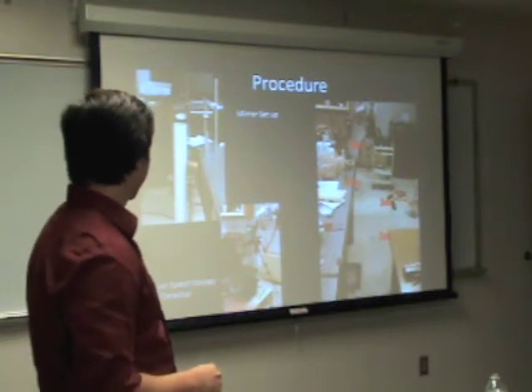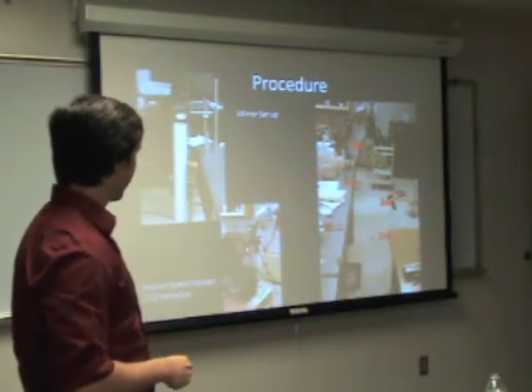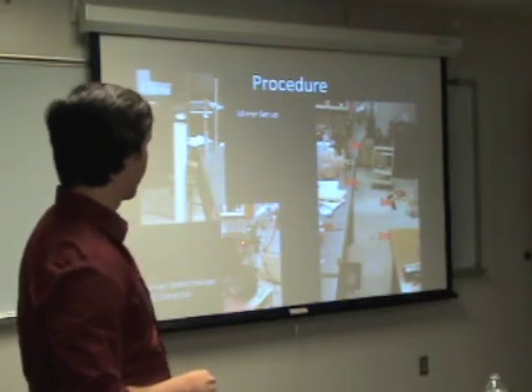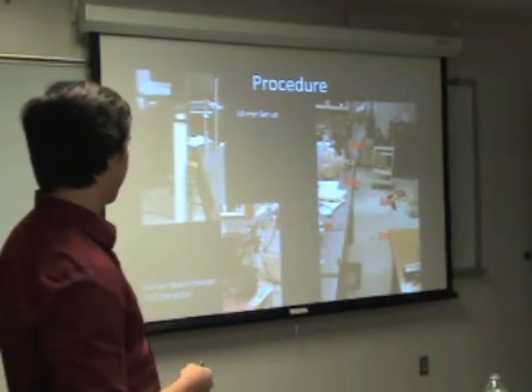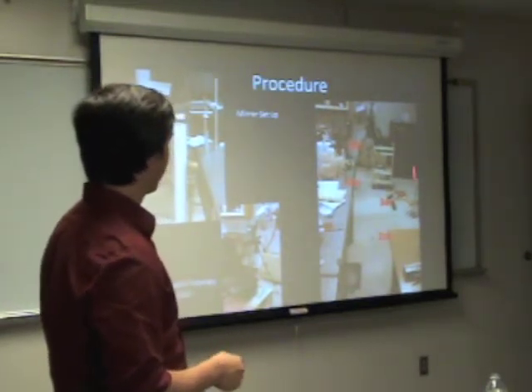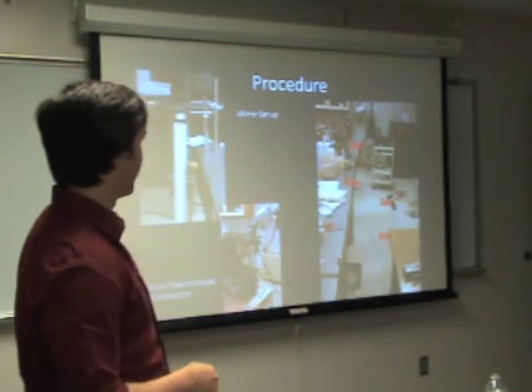And this is our setup. This is actually the laser that we shoot, and this is the computer program we use. It actually has a CCD detector that has to be kept at negative 50 degrees. And this is just our different lengths.